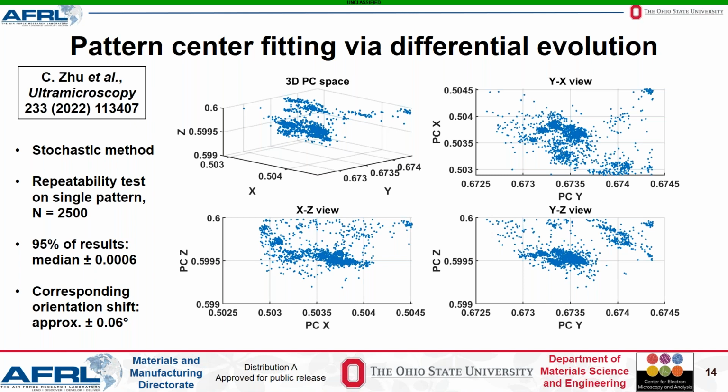Once again, the critical factor seems to be the signal-to-noise ratio of the patterns. My final parameters for acquisition were actually identical to my high-speed EBSD scan parameters, but with the addition of 16 times frame averaging for reduced random noise and an additional step of background correction in post-processing.